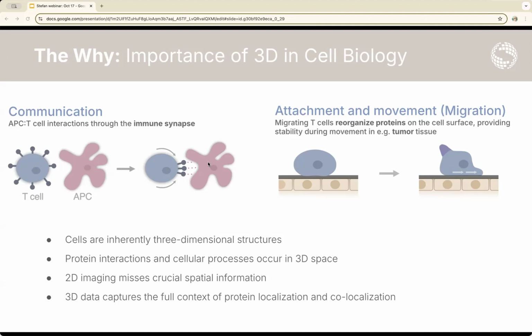So it is instrumental that we're able to resolve this complexity in its native state and look at things that happen in 3D space also using a three-dimensional modality. And this is one aspect where MPX data basically shines because it is natively three-dimensional data, and with the protein colocalization and protein polarization metrics that MPX data provides, exploring these three-dimensional events is much simpler.